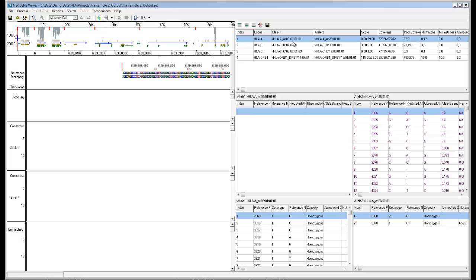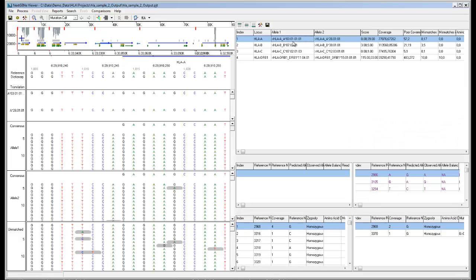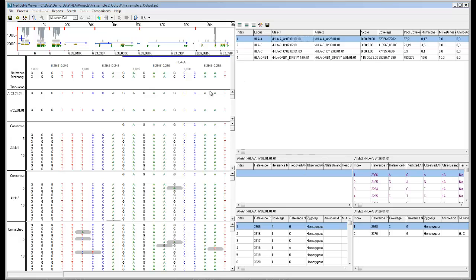Up to the top four allele pair matches can be displayed. By double clicking on any allele pair gene, the lower two reports as well as the HLA view on the left are updated to display information for the selected allele pair.